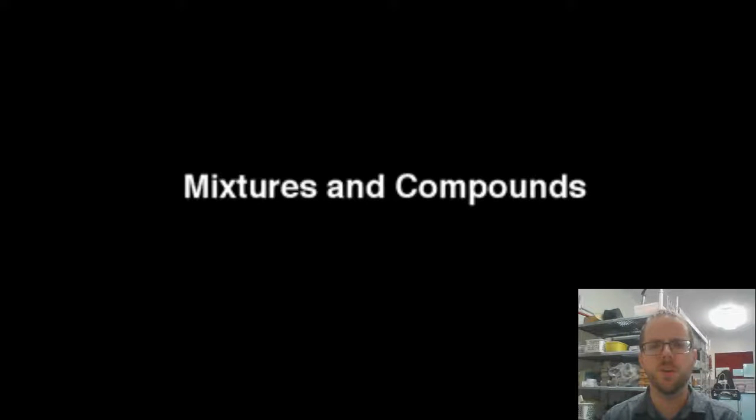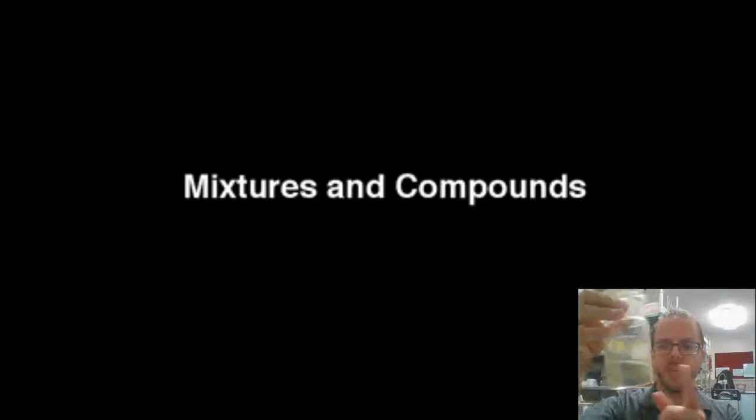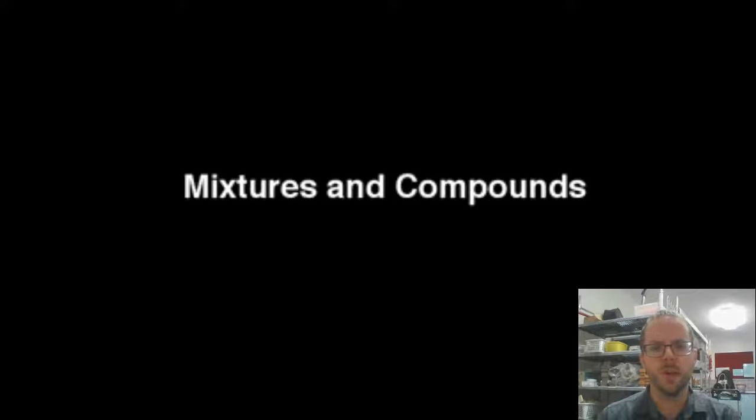A little Keipert Labs curation today, a little David Attenborough style. I've got a little video that I'm going to show you, just to help illustrate our concepts of mixtures and compounds. Okay, so in the previous video that we used, we looked at making a mixture of iron filings and sulfur. And then we looked at how we can use physical techniques, or techniques that exploit its physical properties, to try and separate things. Okay, and so this clip is just going to show you a little bit about what happens if we approach it a bit differently.